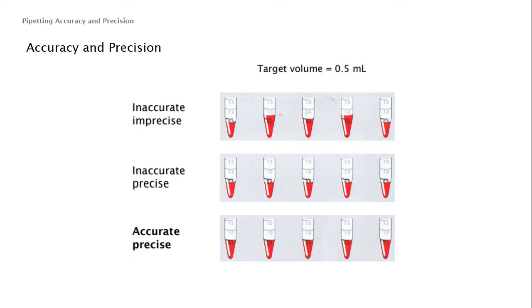So you can see in the illustration that you can tell the measurement is accurate if there is small to no difference between the mean value and the measurement value. When we say precision, it is related to random measurement deviation, also known as imprecision. It is a measurement of the variation of individual measurement values.